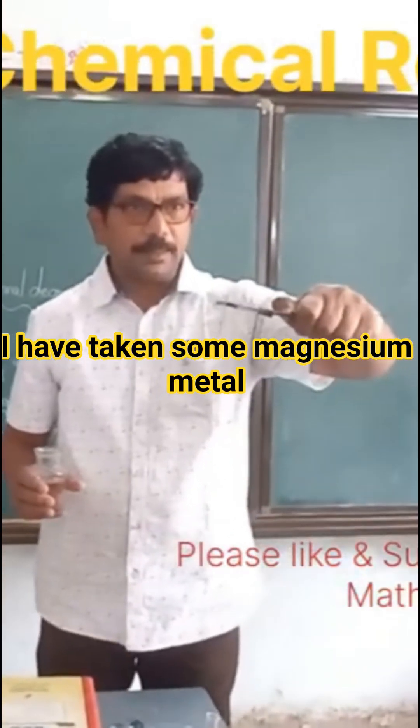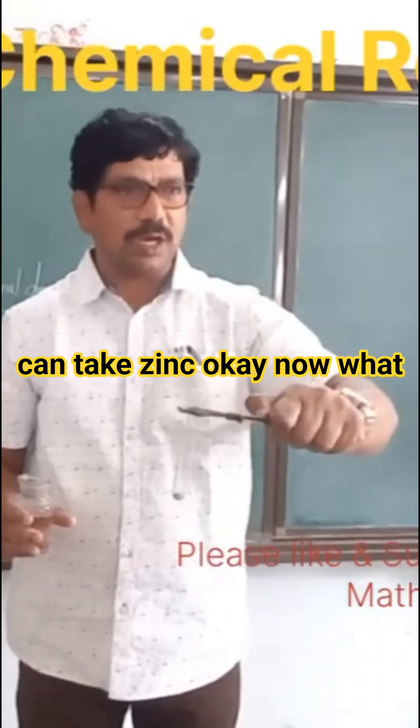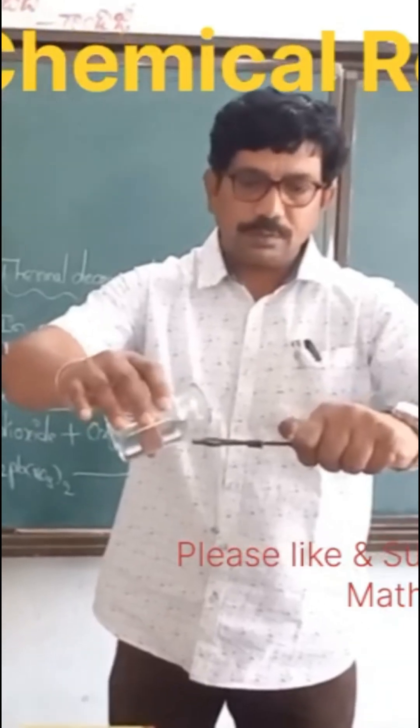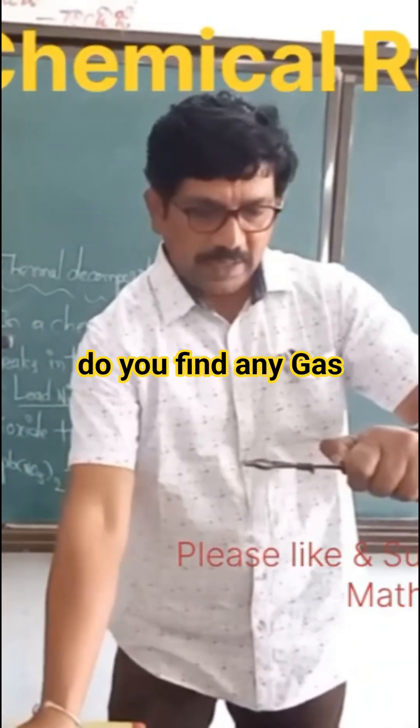I have taken some magnesium metal pieces in the test tube. You can take zinc. I am adding dilute hydrochloric acid. Do you find any gas?